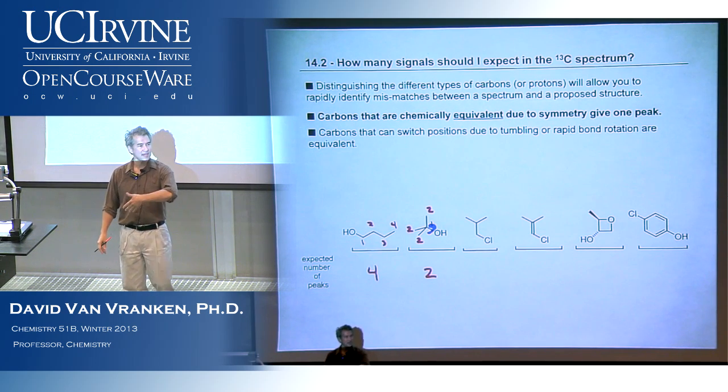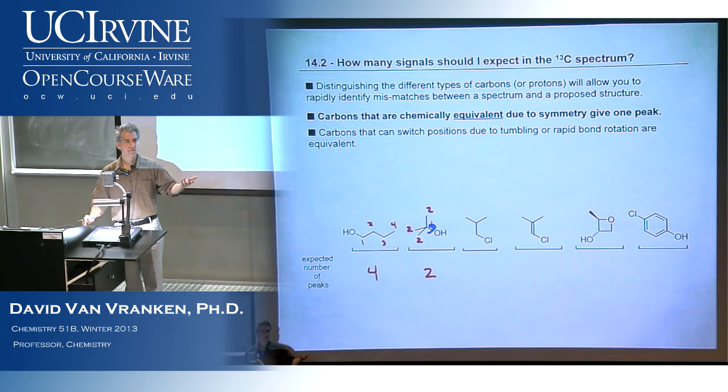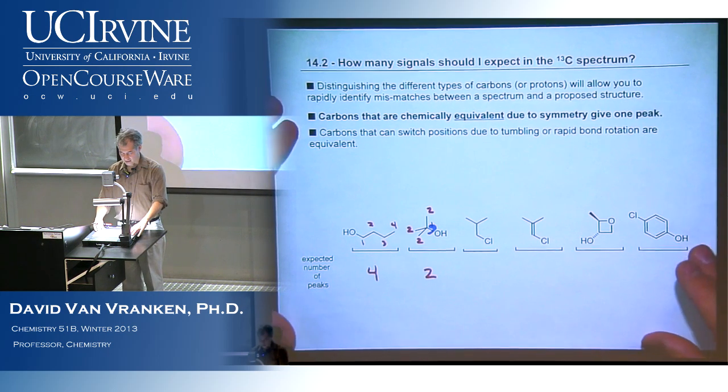And I don't need to know anything about what frequencies they're absorbing and emitting at. I just count the number of peaks. And that's easy to do. And I expect you to be able to do that.